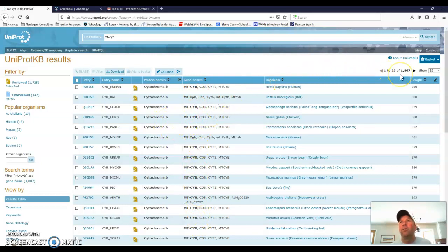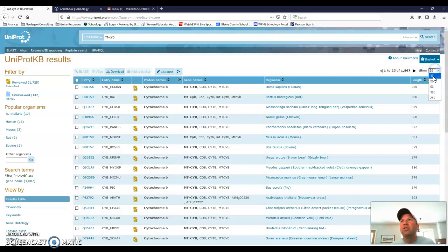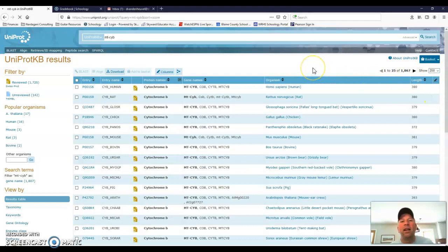Up here on the right-hand side, it says 1 to 25 of 1,867. So there are almost 1,900 different entries, different species for which they have the cytochrome B sequence data in this database. So I'm going to change show 25 to show 250 since there's a lot of them. I want to see a lot on one page.